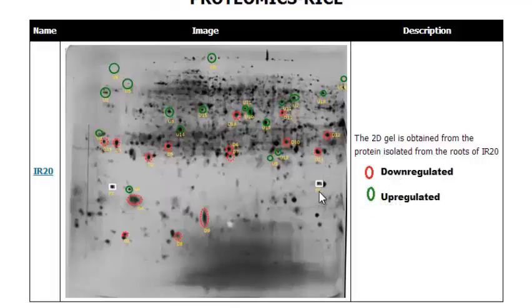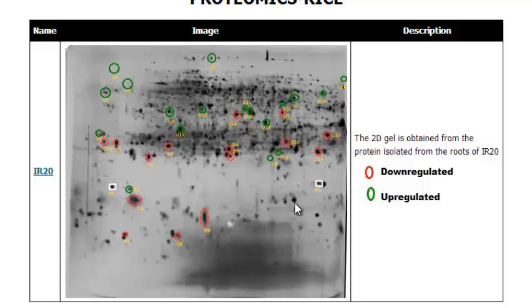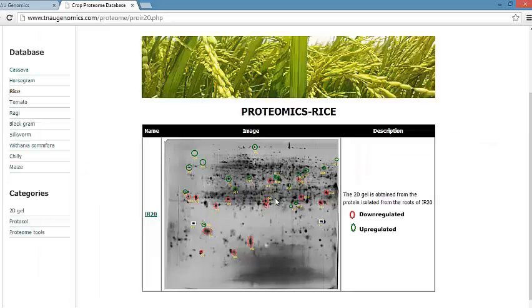Based on root characteristics like root penetration ability, thickness, and bunches, it is analyzed. Nutri-Pattu is a land-raised variety and its life cycle is 110 days. It has higher root penetration than IR20. There are 18 upregulated proteins, 15 downregulated, and 2 positional change proteins. It gives detailed information about the spot ID, PI, molecular weight, sequence, and accession numbers.